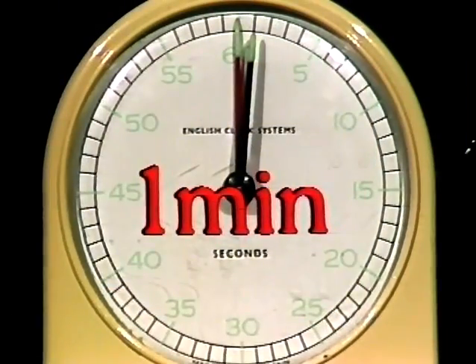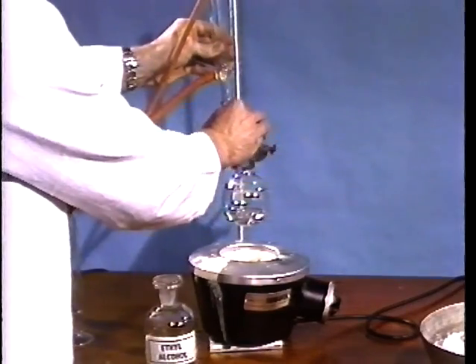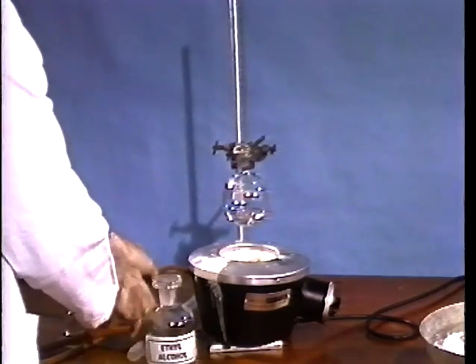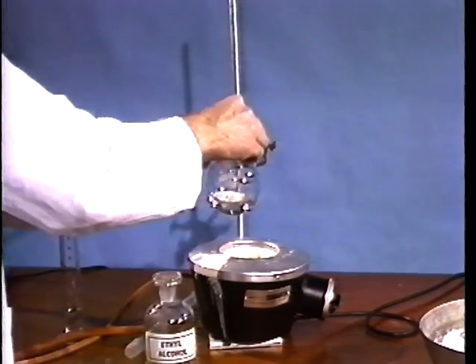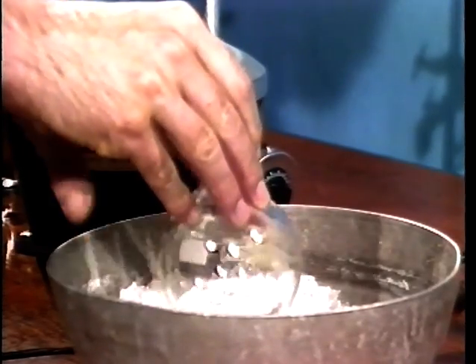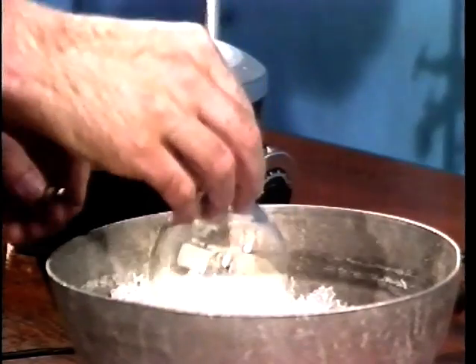Allow the solution to cool first to room temperature, then cool it in an ice bath with occasional swirling in order to induce crystallization.